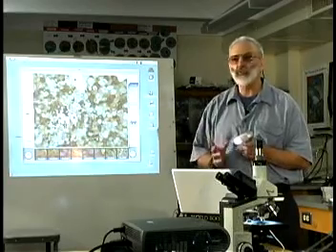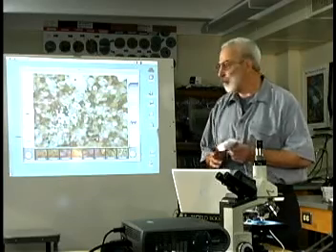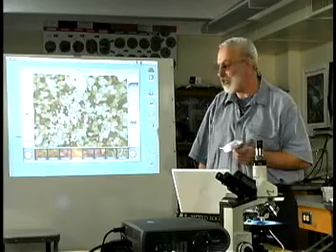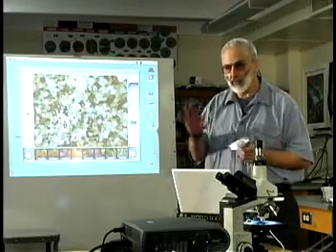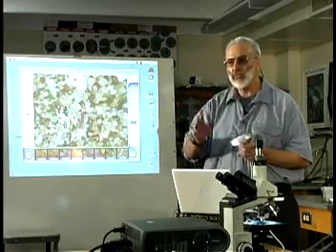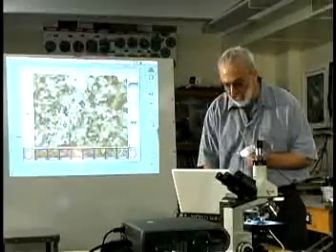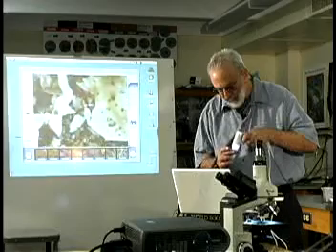What we're going to have to do is learn how to identify these particular minerals. Most of the white ones that you see are quartz. Okay? Most of the dark ones that we see are basaltic. So we're going to be looking at a comparison between 2 totally different types of sources. What I'm going to do now is take another snapshot, but this time more into this area.